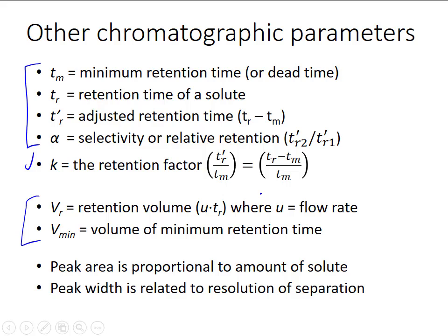And just as we have a minimum retention time for a solute, we can have a minimum retention volume for a solute as well. For various reasons, it is sometimes useful to express the x-axis of a chromatogram in volumes rather than time.